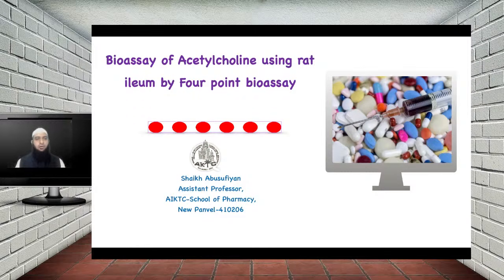Today we'll study the bioassay of acetylcholine using rat ileum by the 4-point bioassay.